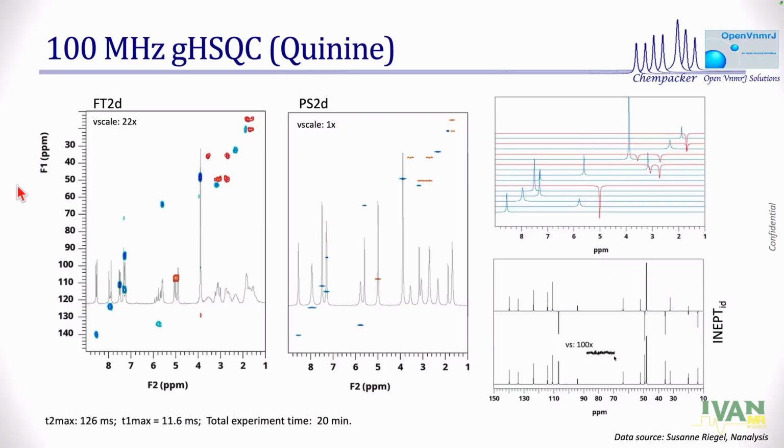Look at this spectrum. This is the carbon simulation. I go back to the table and then take only the F1 information from there: F1 chemical frequency, amplitude, decay rate, constant phase. Those are the only parameters. I take only those from the table, F1, and simulate that. That is an INEPT type of spectrum. Carbon INEPT 1D, an indirectly detected INEPT spectrum.